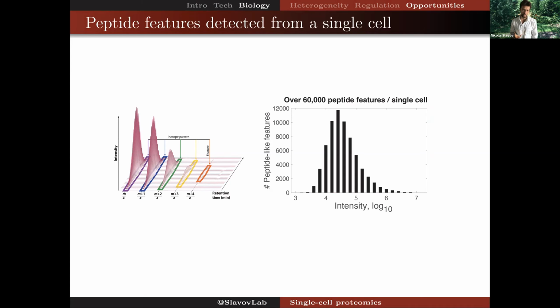We don't yet identify all of their modifications, but I can think of a lot of ways to do that, and that's something that is going to happen. That's why I wanted to tell you to watch out for it, to tell you that what I presented at the moment is representative of the current state of the technology, which is becoming useful for biological investigations, but it's in no way reflective of some asymptote that we are reaching in terms of having used up the limited sensitivity of the mass spec available to us.